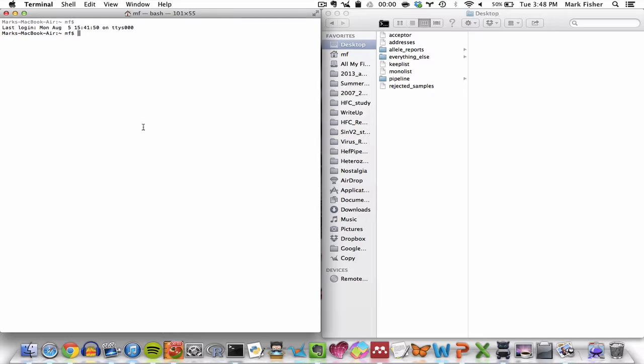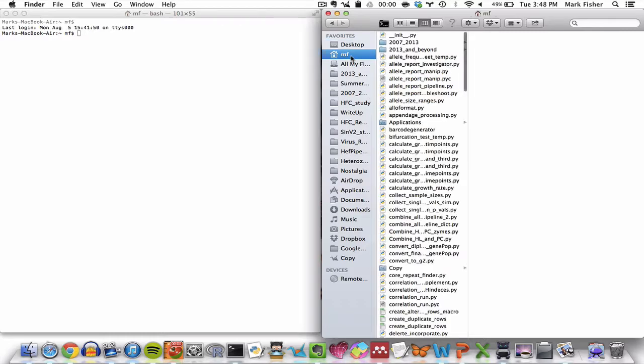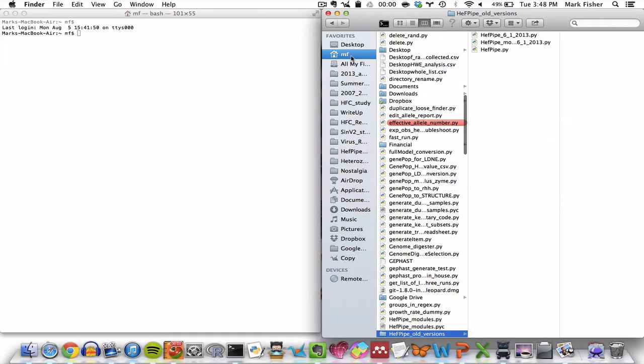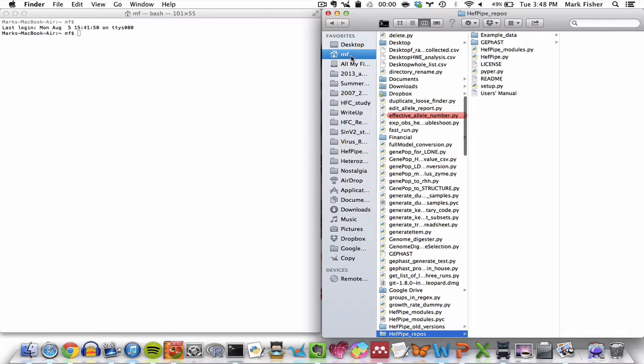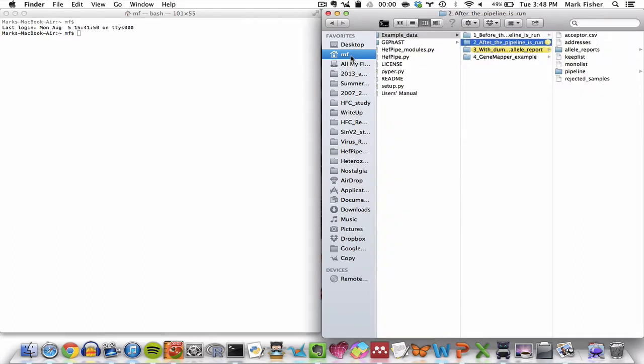For this tutorial we'll be using the example data that you'll find in the directory called ForGeneMapperExample. You can find that once you download the software package. It's in example data and then it's the fourth directory here.